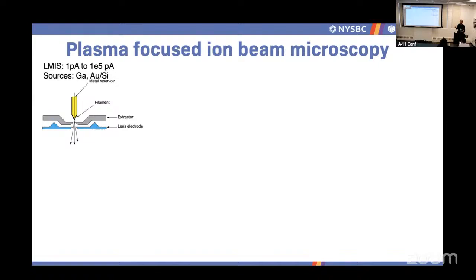There's generally speaking one problem. As you increase your current, you start sputtering ions from further away. So your source is not going to be a point any more; it will be something that resembles the shape of your tip. And this will essentially result in one thing, which is a loss of coherence. And the loss of coherence will result in a significant loss in resolution. So your spot size, as you increase your current, just goes up.